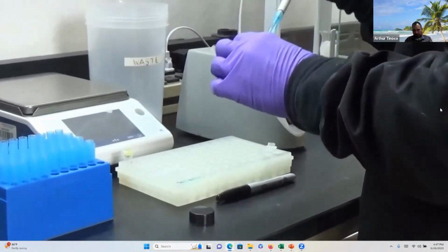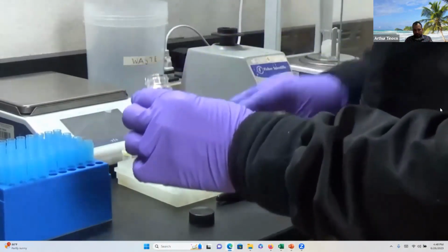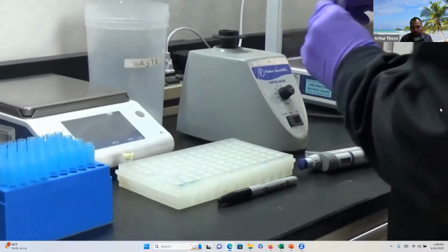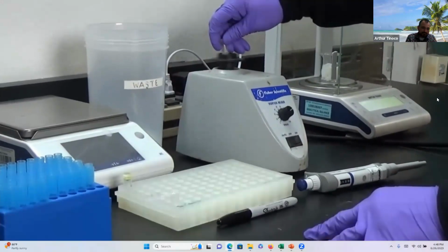To remind you, the solvent consists of 50% water, 50% acetonitrile, and 0.1% of TFA. I often have to vortex the solution because it's not readily soluble.